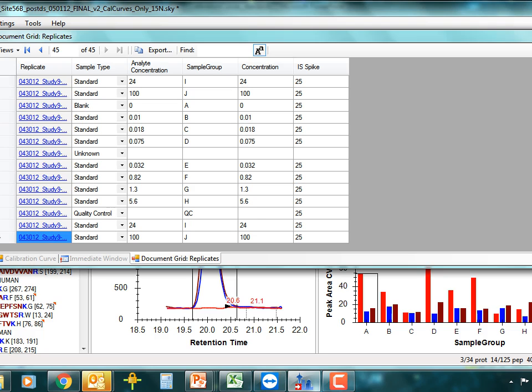Or in the afternoon, in the next half hour after break, before we hear about LOD, LOQ, if there are things that you haven't yet done and you'd like to do, like paste a peptide list into Skyline, we can do that. If you want to paste a peptide into Skyline and make sure the spectral library matches, we could do that. So when we come back, or now if you have suggestions, let me know, and we can begin setting that up for after the break.